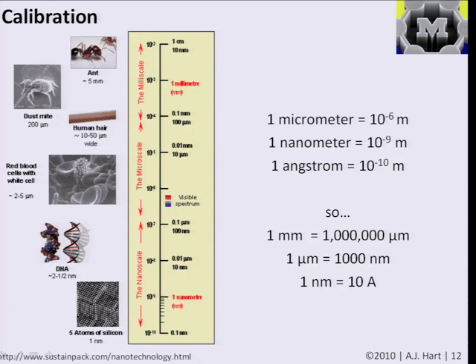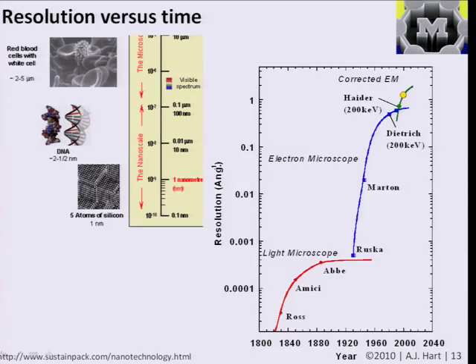So let's start thinking about these different characterization techniques, and by showing our calibration ruler again, I want to emphasize that conventional optical microscopy, which was the state of the art until the, say, early to mid 1900s, puts us at a limit of, say, a few hundred nanometers. However, a lot of the things we're interested in looking at the nanoscale are way smaller than that, so we need to devise new techniques to understand and observe these structures.